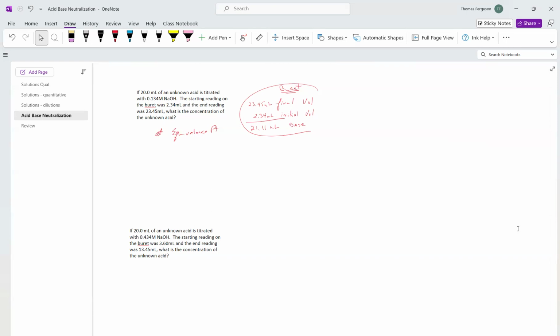Okay, on your burette, there are 2 ways to run it. You can start exactly at 0, that would be 0.00, 2 decimal places on the burette. Or you can start anywhere you want, up towards the top, like it could be 1.50. It doesn't really matter. If you start at 0.00, you don't have to subtract. If you start any place other than 0, you have to subtract the final and the beginning readings, and that'll get your net results.